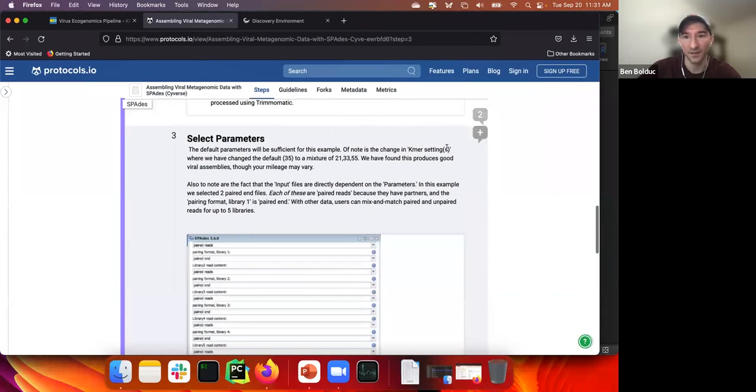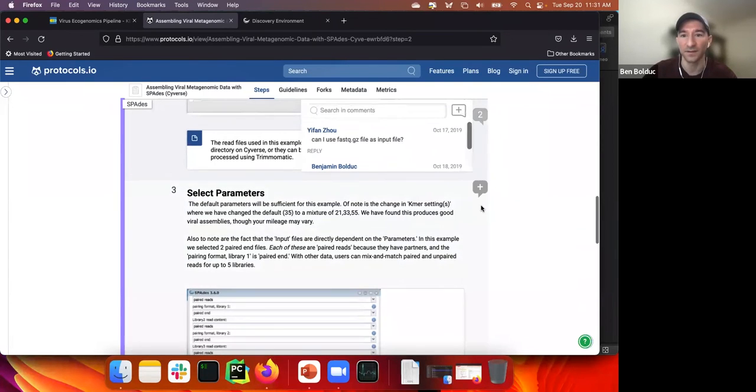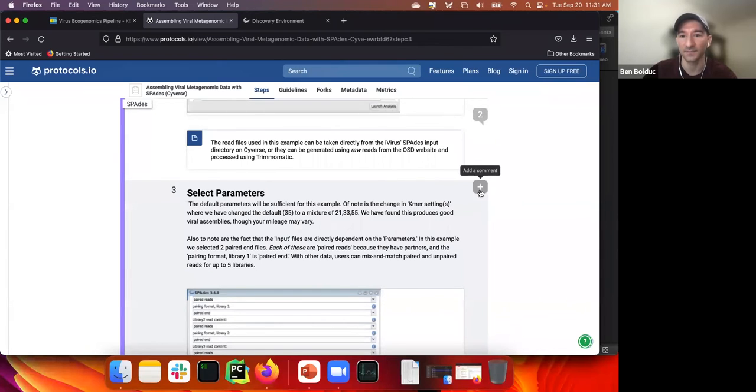Okay, don't yell at me. I could write, if I signed in, author, why do you have these 3 k-mers? I thought that the best practices guidelines said that you should have a few more k-mers than that. And then someone like myself would come by and respond to that.